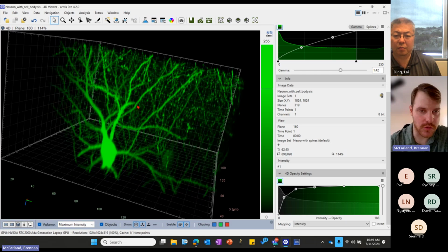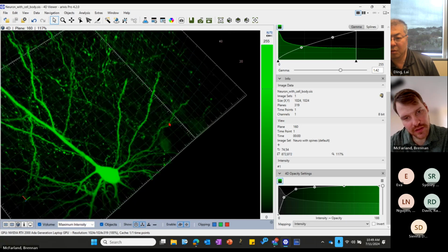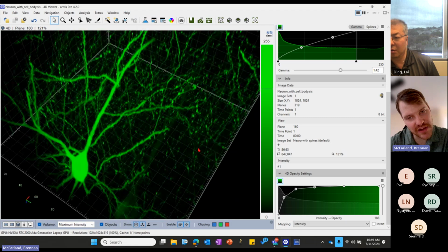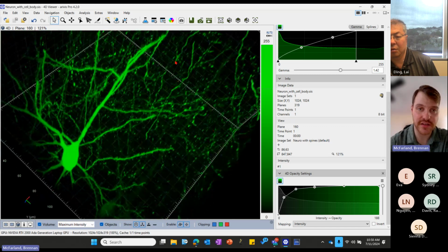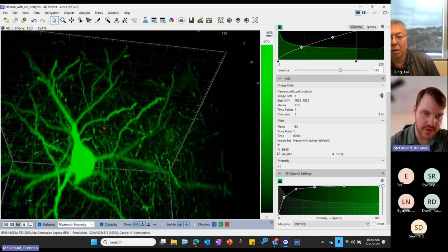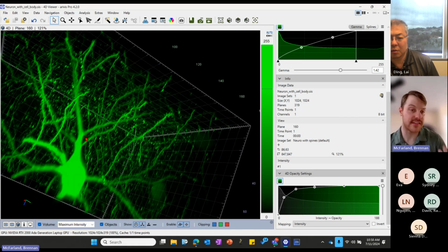All right, so this is what I have for an example 3D data set for a neuron with a cell body. A little bit busier, a lot more background in terms of maybe neurites that are within this ROI but aren't touching or directly connected to this cell body. Some other stuff in here. So the difference between neuron tracing and neurite tracing is the cell body.